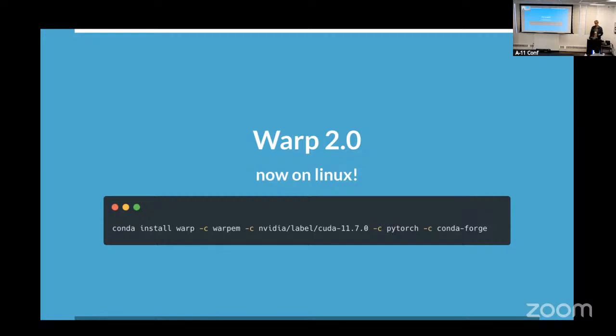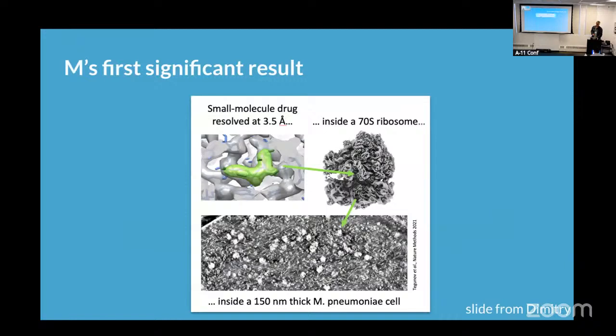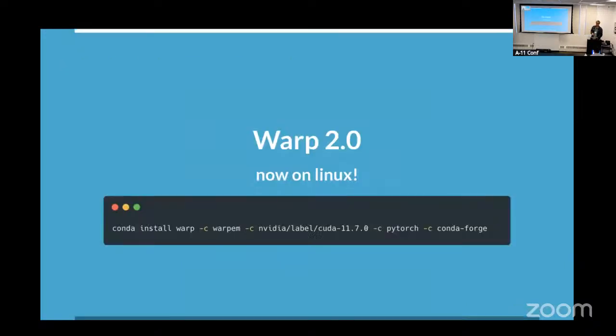So the workshop that we're going to be doing today is using this command line Warp experience. I'll also show in a little bit, we're not expecting people to stay at the command line forever. That's not the long-term plan. This is a kind of let's get set up for the future move. But yeah, that's where we're at now. And hopefully you guys are willing to not have a nice web app for today's tutorial.